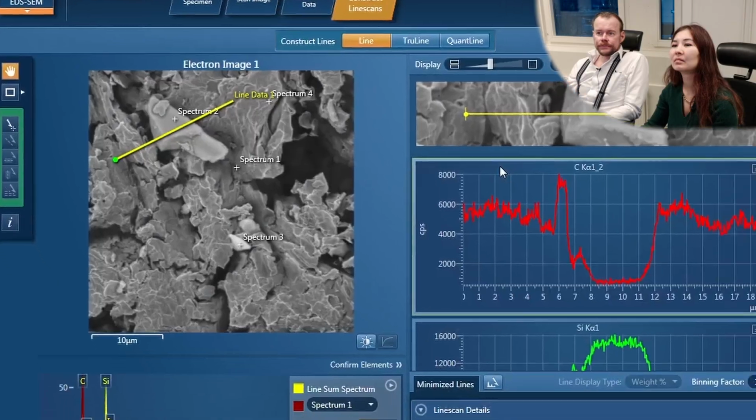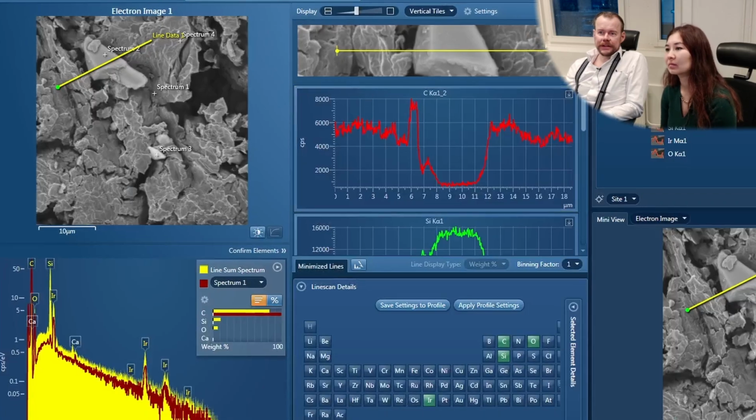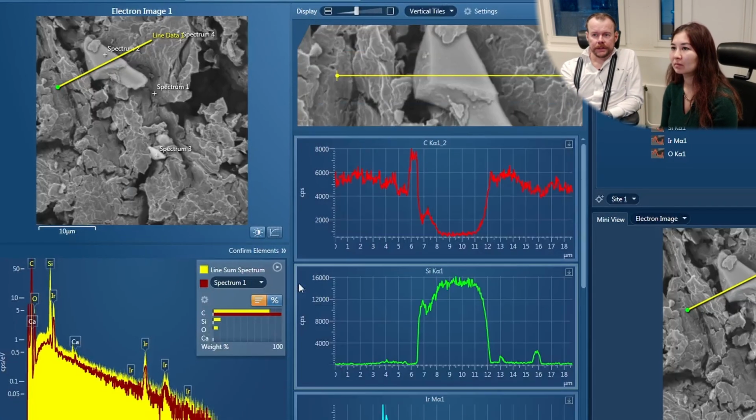You can run a fixed time, but most of the time you run it until you're satisfied with the statistics in your spectra. And we can see it measures 500 points here. I can do fewer points than that also. 500 was a lot actually. So let's go to construct line scanner, next tab order. And then we can see here, we can remove this one also.